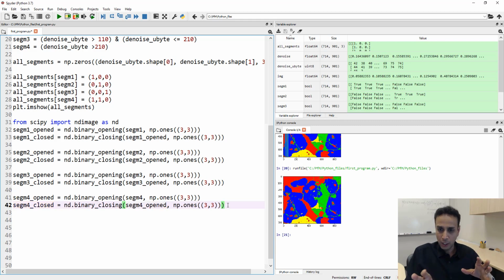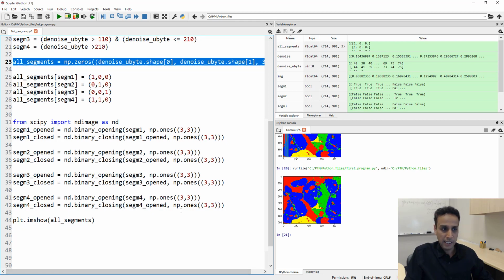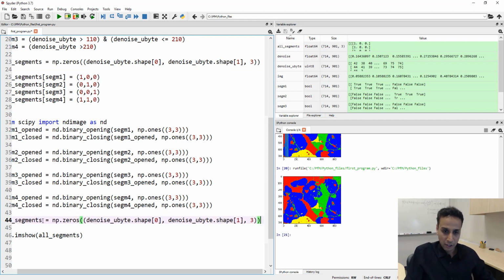We have done so many things, and I hope we followed the procedure. We'll find out, you know, if something is wrong. So I'm gonna take that image off, and then take that line off, and then all segments. And now let's, I'm actually thinking about, yeah, we should create this again. We should do this one more time, sorry. And once this is done, let's actually create all segments. Let's call this cleaned.